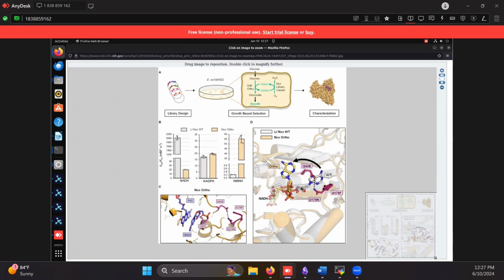For the image D, because it's comparing two different protein structures, they've made the ligands the same color as the structure that they are part of. So we can quickly see, hey, this light yellow is the same as this orange over here, and this white is from the same representation as the white representation here. So there's different ways to go about it. I think color is one very underrated way of looking at it when you're making your images.